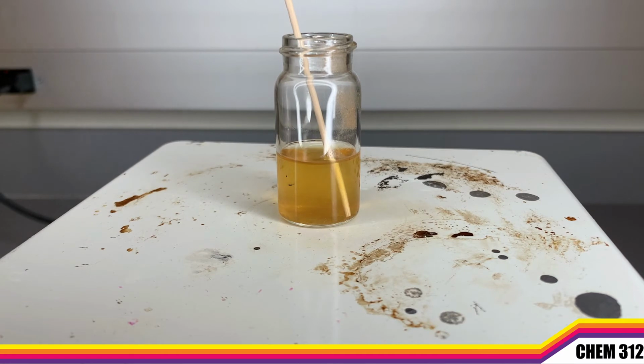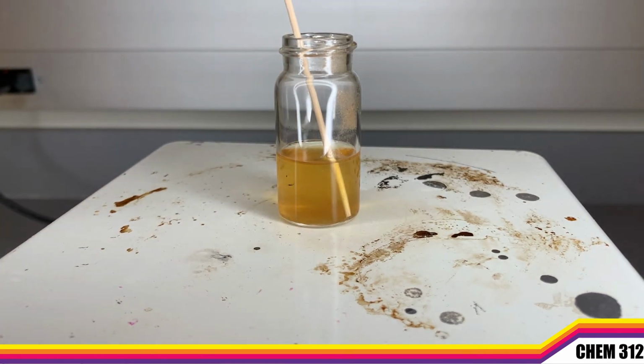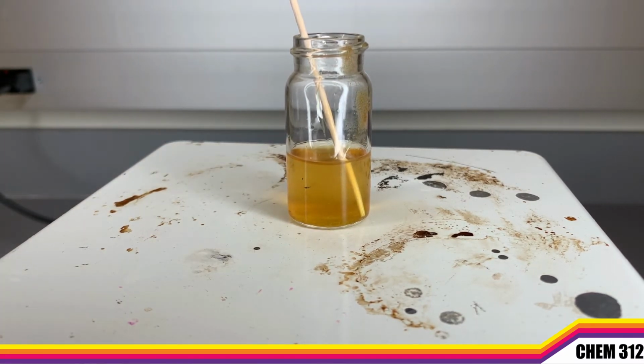And the last thing I'm going to add is my salicylaldehyde. I know that's a mouthful, but here we go. This is inside a syringe here. If you can see it, it's actually a clear and colorless liquid. So our aminophenol was brown, and our salicylaldehyde is clear and colorless. I'm going to go ahead and add this in here. That was about 0.1 milliliters, sorry. And so we have this in our solution.